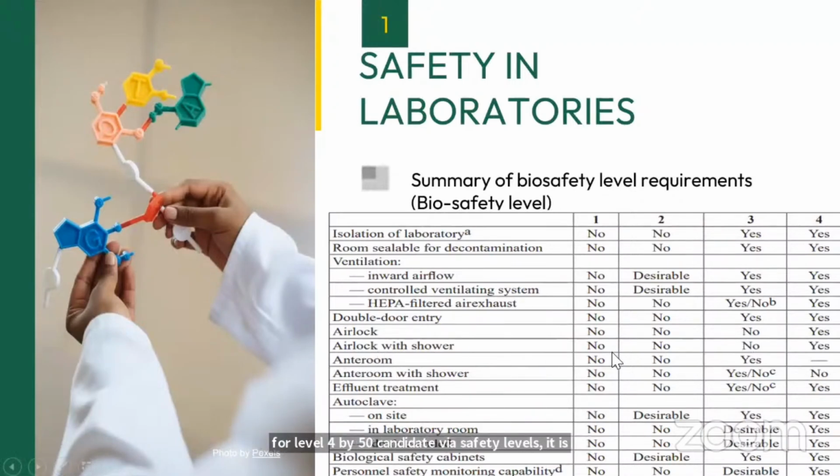Airlock with shower. You must have seen in some movies this sophisticated airlock. Once you enter from one area to another before entering biosafety level 4, there will be one airlock and then there will be a shower coming over your body. So it is mandatory for level 4.